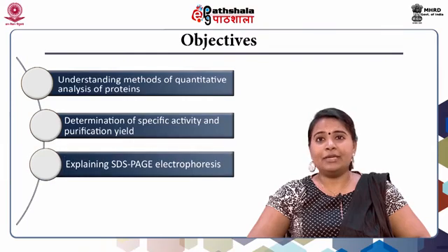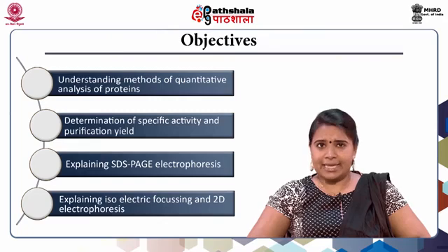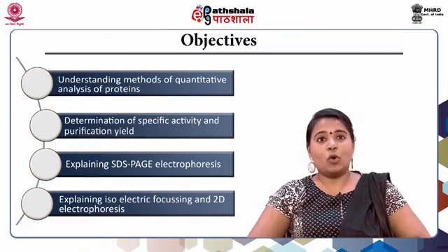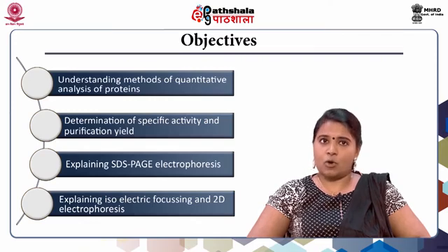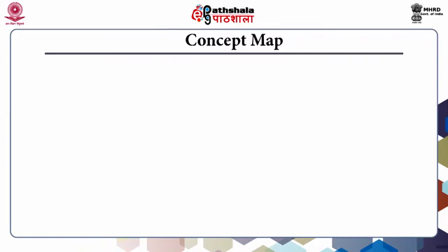These are like day-to-day lab protocols. For example, we will look at assays for determining protein content in a sample and also study the electrophoresis of protein in detail. To start, this concept map shows the outline of today's lecture.